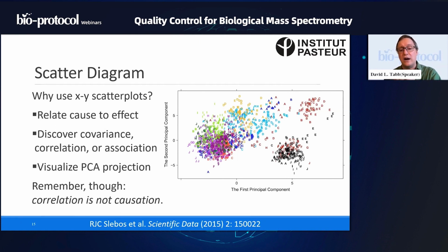And so we wanted to track over time whether these data looked like each other, or did we see a strong change in how the instrument presented data from month 1 to month 8. And there was quite a lot of walk around within this space, such that when all of the raw files for the black set, which I believe was the first one we ran, and the deep red set, the second one we ran, tend to separate from everything else. This is an example of instrumental drift over time.